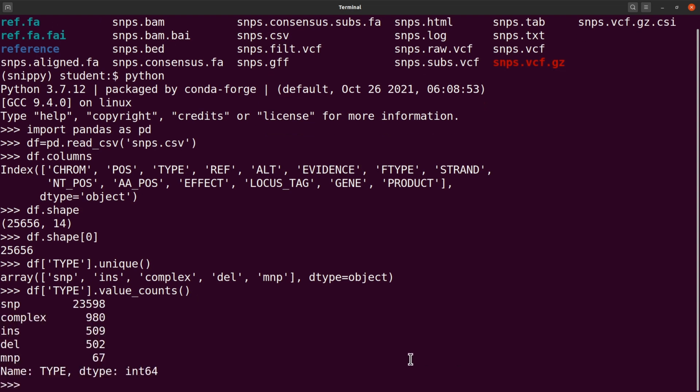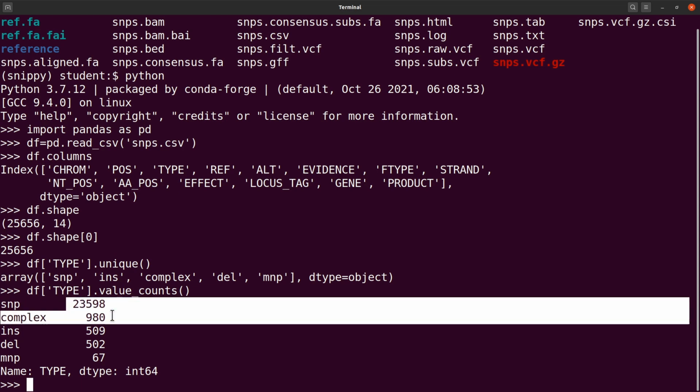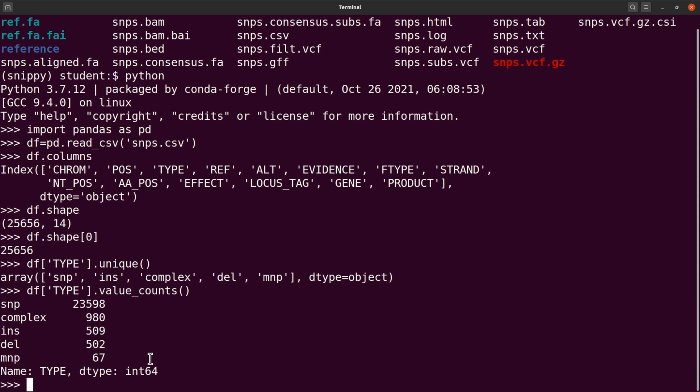So we have them here. For each type, you will have the counts here. Okay, so this is how we do it. This one also sorts it out for you, but those things, we will look at them at another time. So that's how we do the count. It's very cool. We've been able to do lots of stuff. With Python, you'll be able to automate a number of these activities. You can even store the code somewhere and then reuse it. So let's continue.